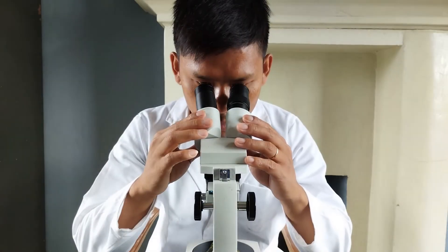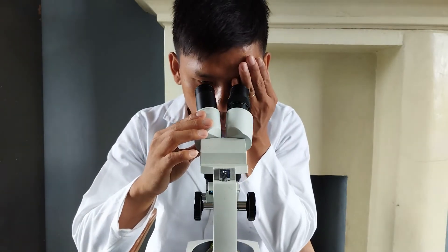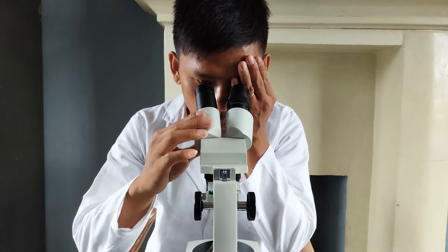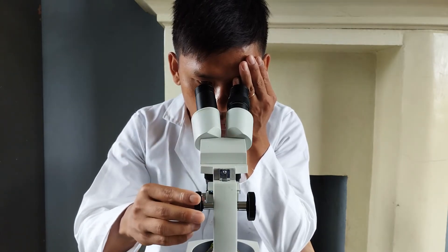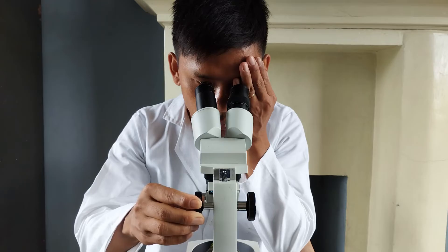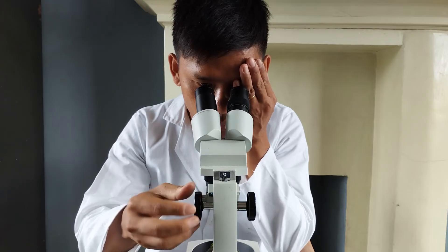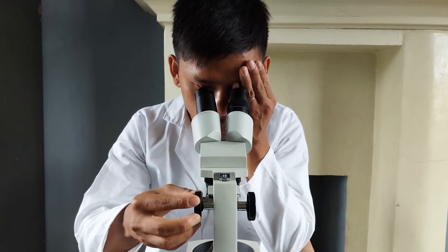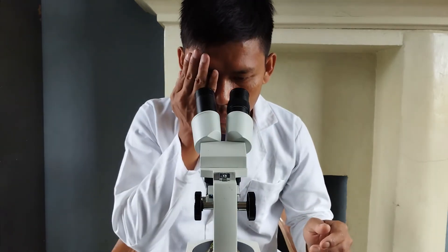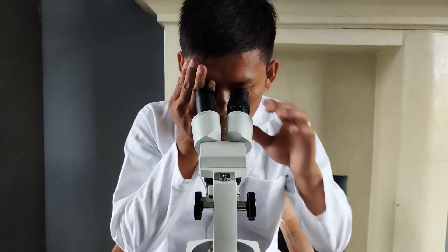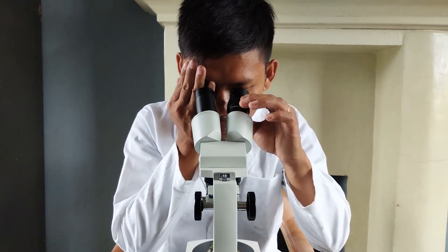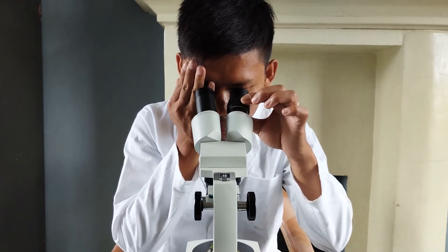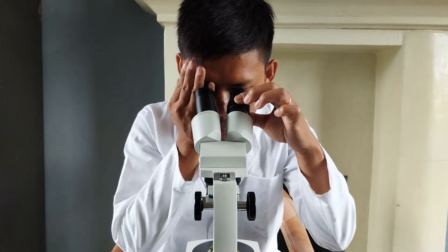To focus align both eyepieces, first cover the left eye and look into the right eyepiece with the right eye, then carefully rotate the focus adjustment knob until the specimen is in focus. Once you have the specimen in focus through the right eyepiece, cover the right eye and then look through the left eyepiece using the left eye. Without readjusting the focus adjustment knob that had been already set for the right eye, adjust the focus of the left eyepiece by rotating the eyepiece tube clockwise or counterclockwise until the specimen comes into clear focus.